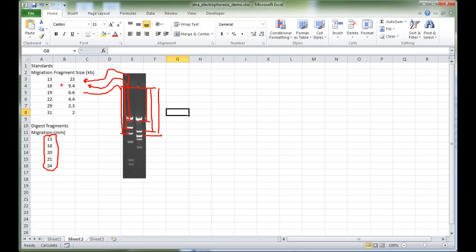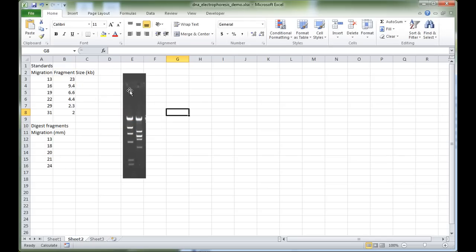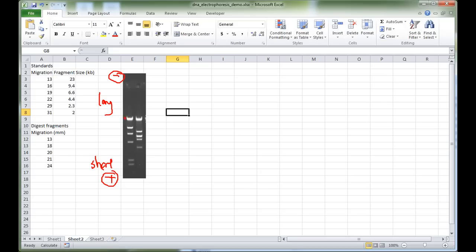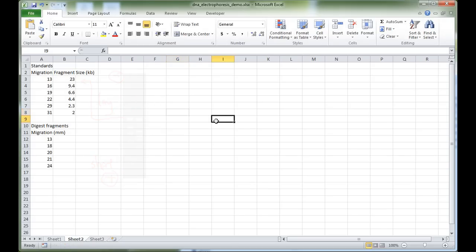Because the negative cathode is at the top and the positive anode is at the bottom, we know that the longer fragments will be up here and the shorter fragments will be down here. So this long fragment here corresponds to the 23 kilobase pair fragment, which has the lowest migration distance in millimeters.